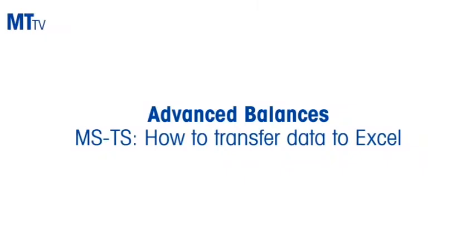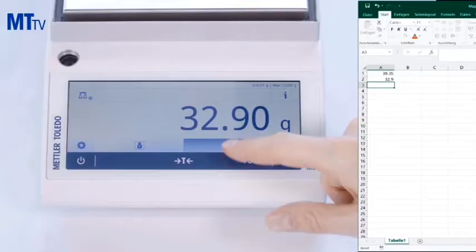In this video we're going to learn how simple it is to transfer weighing data from an MSTS balance to a Windows PC using the PC Direct application. This will enable us to transfer simple weighing data directly into a Windows application. In this case we're going to use Microsoft Excel, but it could be almost any Windows app.